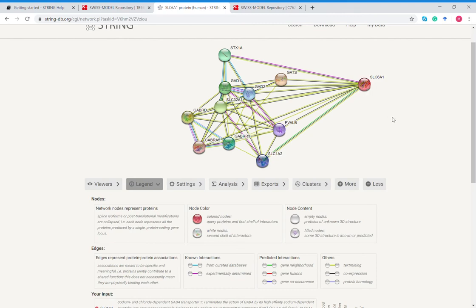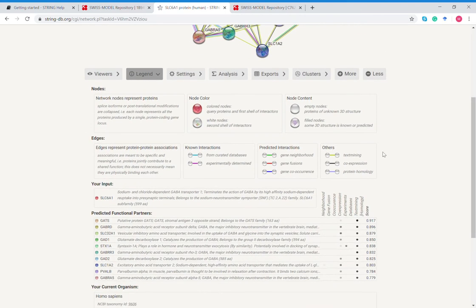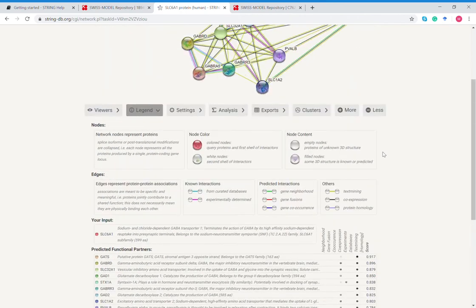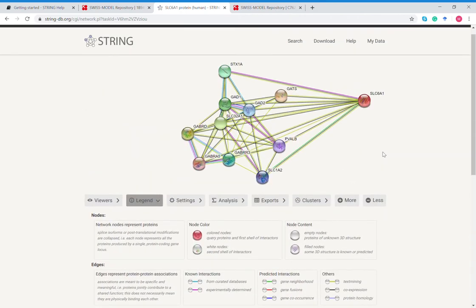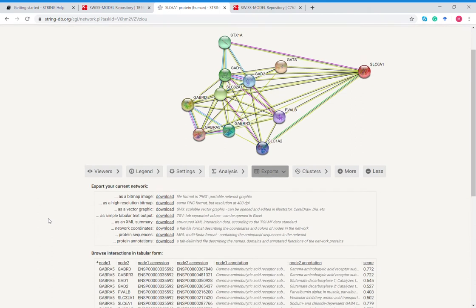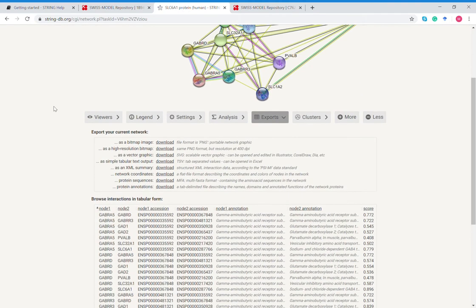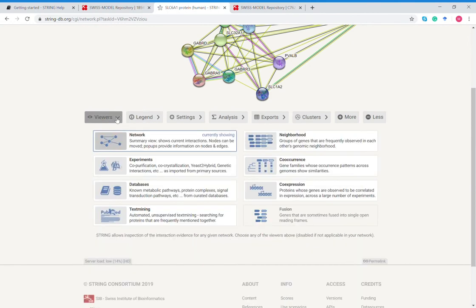From here you can export this as just a straight-up image. You can export it as a vector graphic which means that you can edit this, you can scroll over your proteins in it as well. If you're given some sort of online presentation, this would be a really cool thing to add to your presentation.